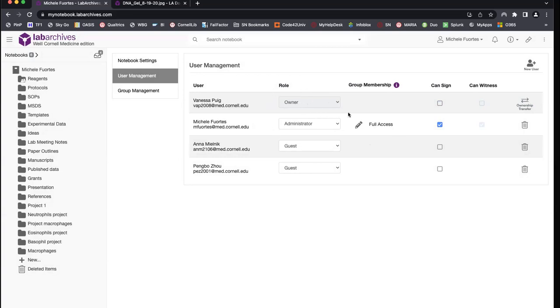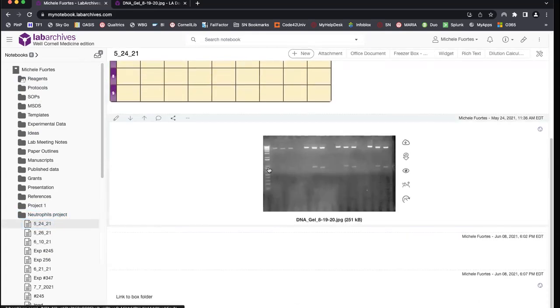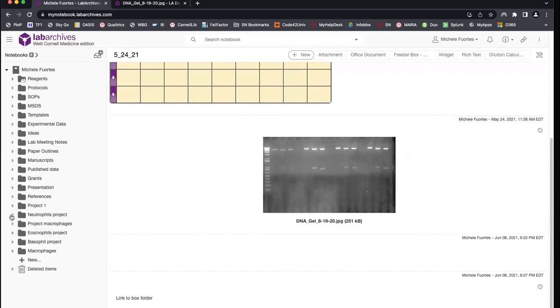I can invite other people, I can share it with everybody, and I can add notes. I can do everything, but Vanessa stays as the owner. So you can see that here, my view has not changed very much. Any page that I had before, I still have the same access.